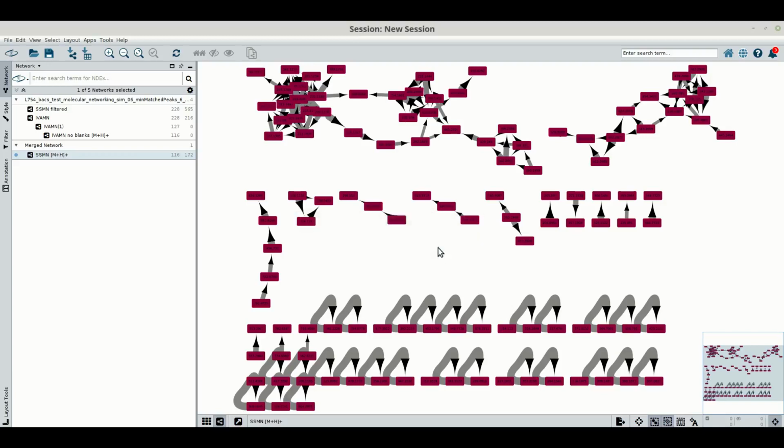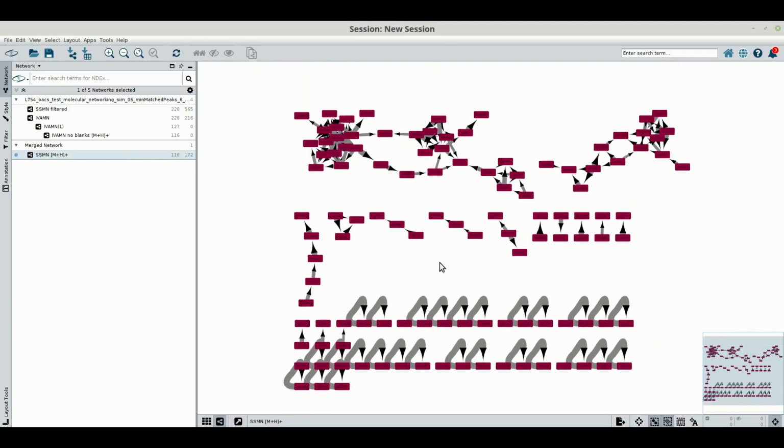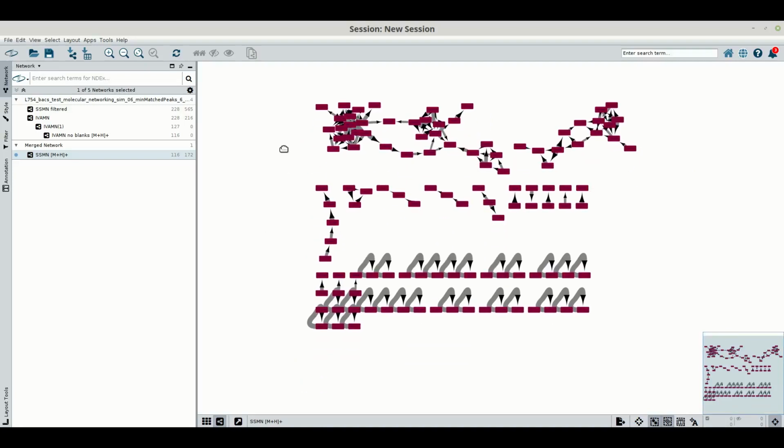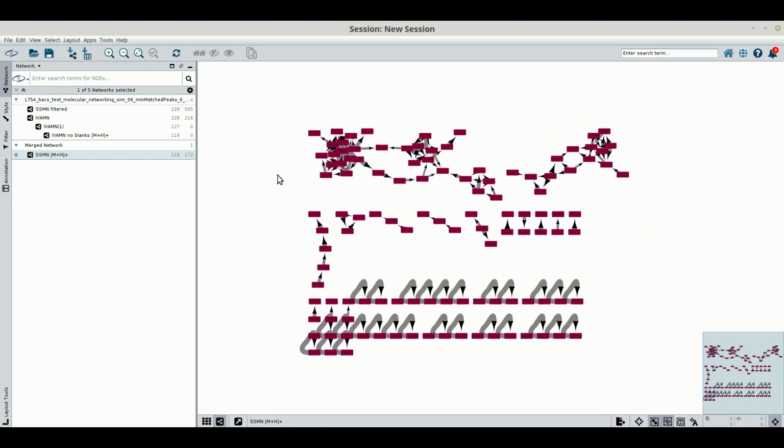Cool. Now you could proceed by analyzing your data set and looking only at the putative real metabolites that were present in your samples. I hope you liked it and that you could follow this tutorial and better understand where the information is present in the NP³ MS Workflow output.